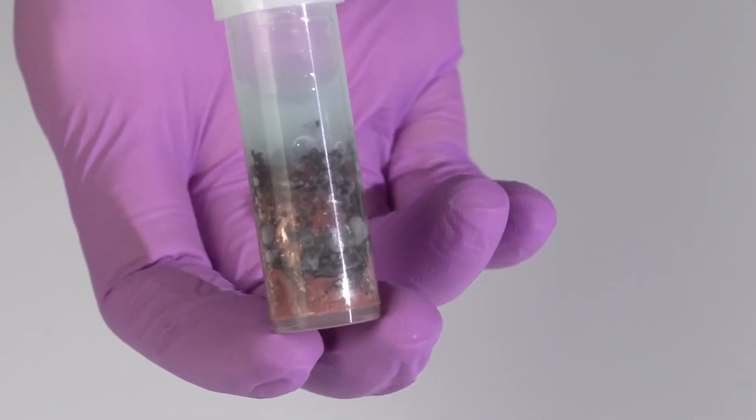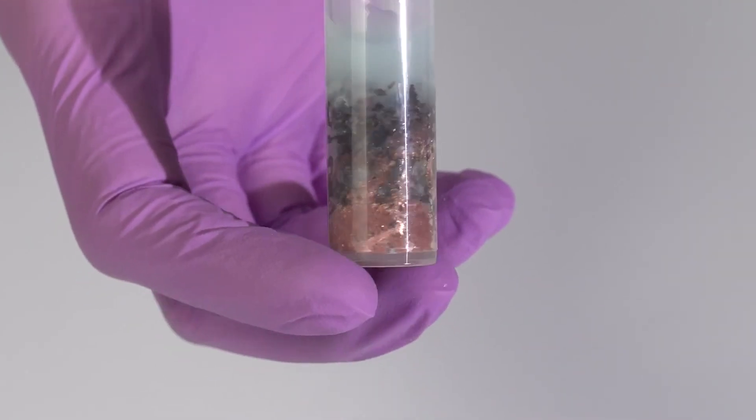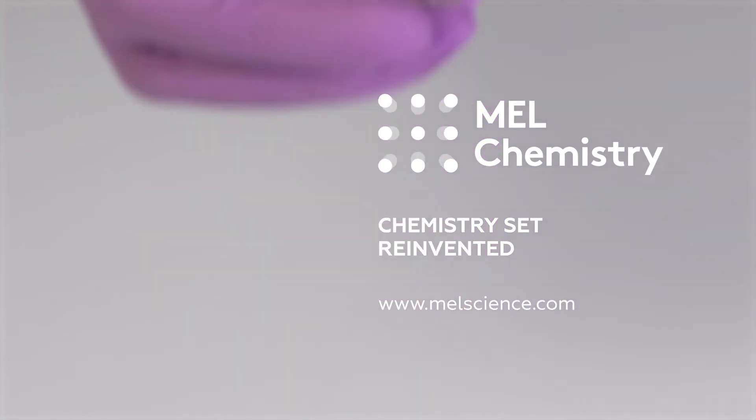Watch the reaction mixture for several days. Tiny copper branches will develop into a copper bush. Learn more about this experiment on our MEL Science website.